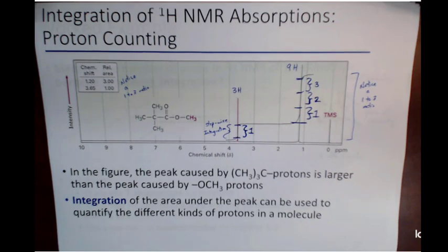one other thing that you want to pay attention to in our spectrum is that we'll have something called integration. For anyone who has taken Cal, I think it's brought up in Cal 2, I don't know what it is here at State, but it's either in Cal 2 or Cal 3.